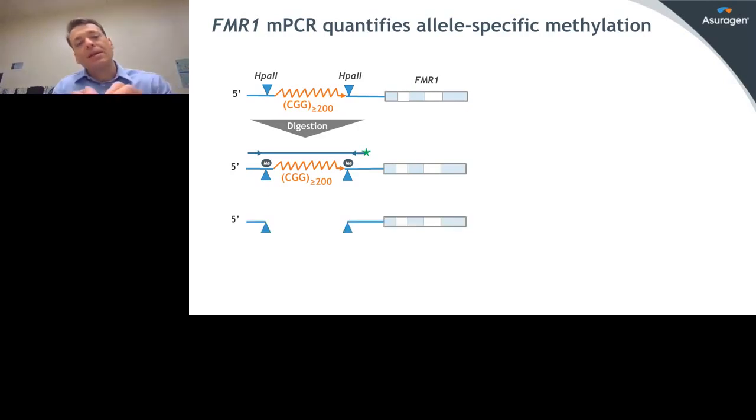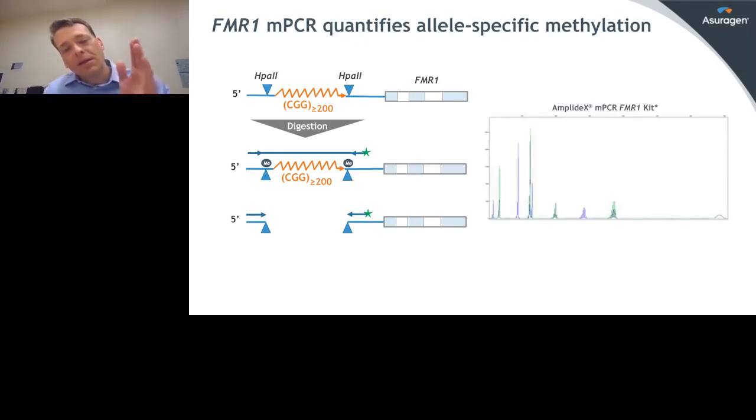and we split that original sample into 2 aliquots. We carry out a controlled digestion, and we carry out a digestion with HpaII, which again will be sensitive to the methylation state. If the sample is methylated, then HpaII sites are protected, and as a result, you'll be able to make a full-length amplicon. However, if either of those 2 HpaII sites are unmethylated, then the restriction endonuclease will cut, and it will break the template in a way that will prevent a product from being formed.